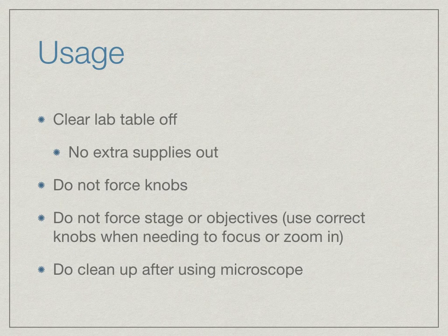When using the microscope, make sure initially that you clear off the lab table. The only thing you should have out is the microscope itself, whatever you're using to record information from your observations, and whatever specimens and slides you are going to be looking at. At no time should you ever force the knobs. If you encounter any resistance, immediately reverse the direction you were spinning the knob. If there is still resistance, make sure you get a teacher.